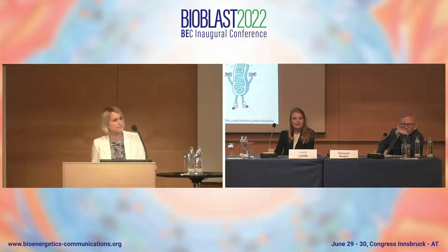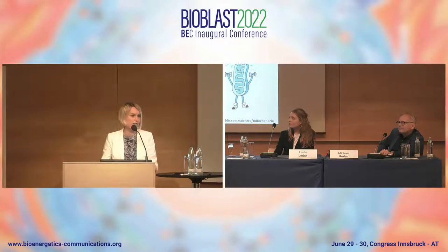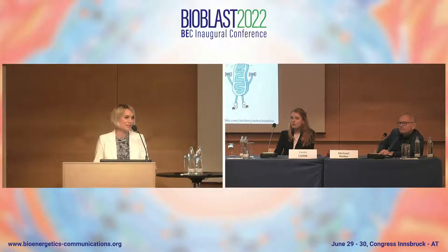Hi, Timi. So the ROS production was with succinate, so RET, you call it, reverse electron transfer. Did you do experiments in the presence of rotenone, with succinate to drive the ROS production, say, downstream to complex three? No, we haven't tried this one. We have not checked the pH dependence, for example, with rotenone, but we were interested in RET, the reverse electron transfer, so that's why we did not add rotenone, because it blocks the reverse electron transfer. But it would be interesting to check how it modulates the H2O2 flux into the forward direction.